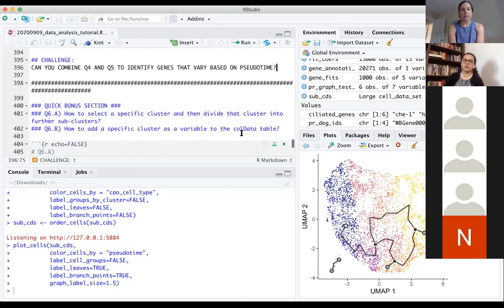Great. So pseudo-time analysis is the main component of the trajectory part, and it's always done clubbed with the graph test, because just learning the graph is not going to tell you anything. You want to see the gene expression changes in the end. That's why we do RNA-seq.